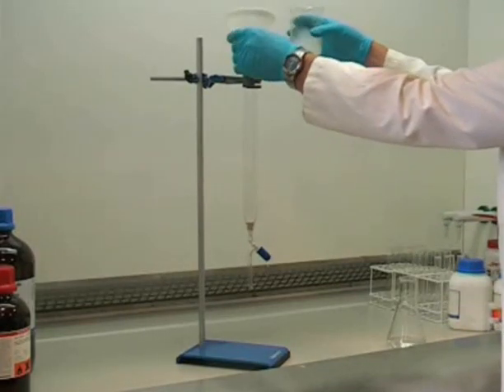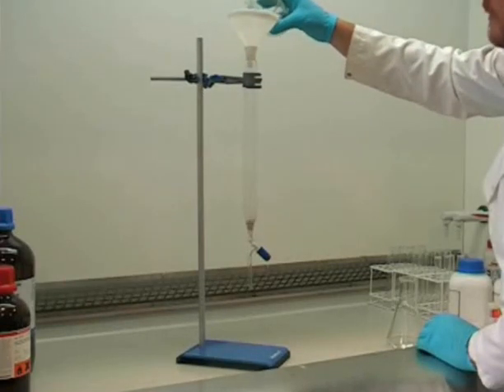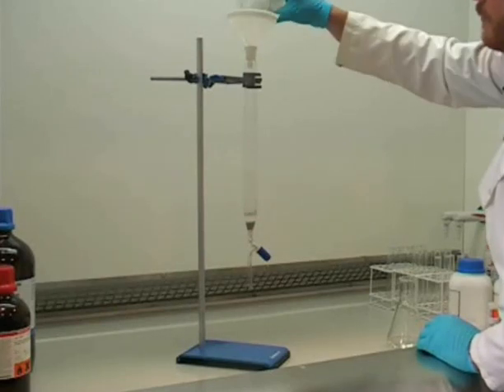Again, a funnel should be placed in the neck of the column to assist with pouring. You will need to occasionally swirl the beaker to ensure that the silica doesn't settle out in the bottom of the beaker.